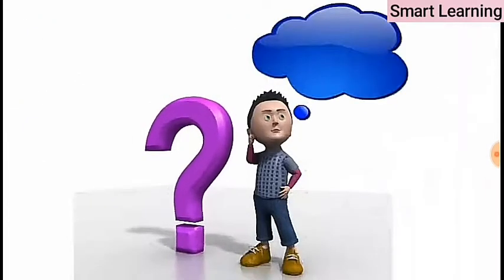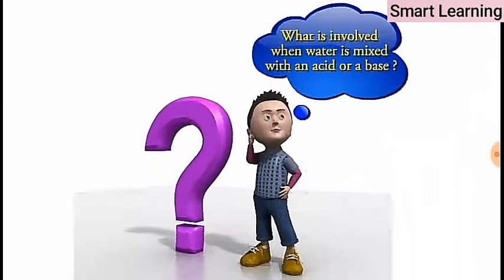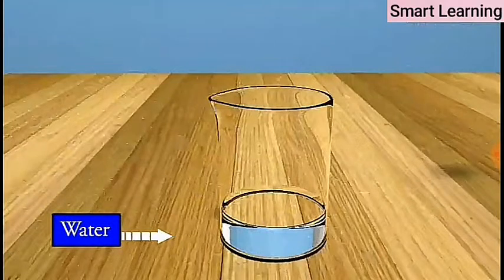Let us see what is involved when water is mixed with an acid or a base. Take 10 ml water in a beaker.